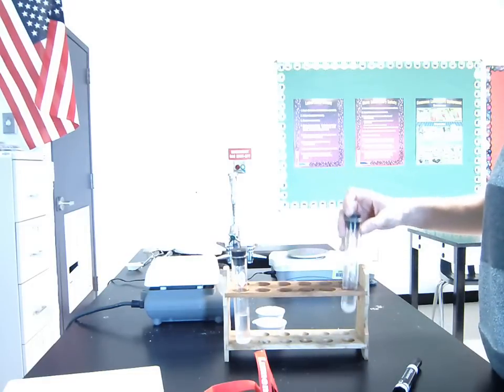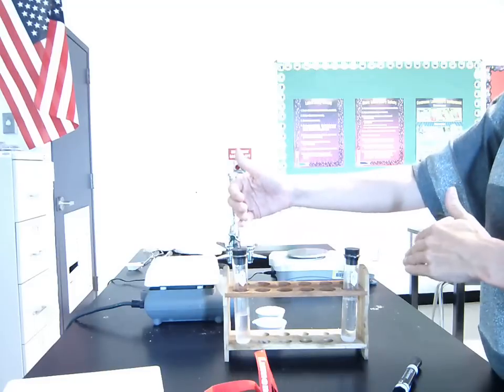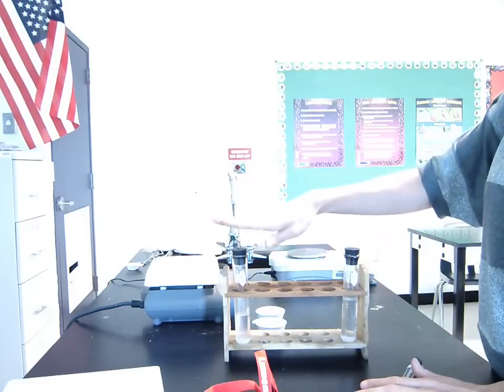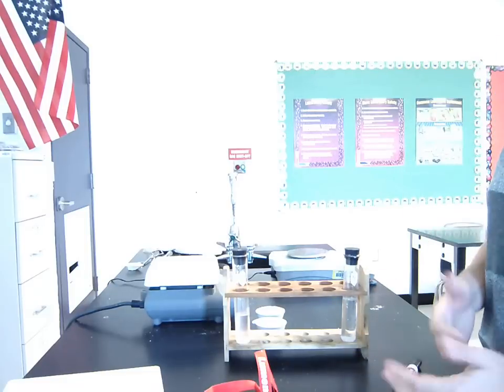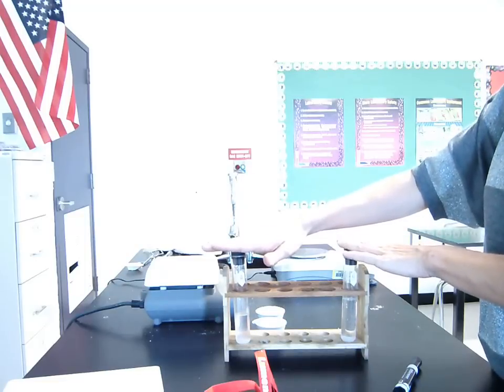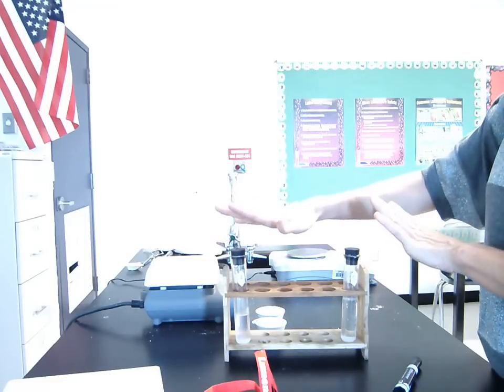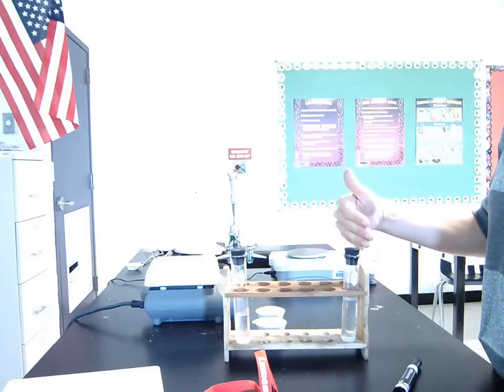So I'm starting with two saturated solutions, two different saturated solutions. For the purpose of the lab, we're just going to call them A and B, just for simplicity's sake, because it doesn't really matter what the substances are. Okay, so that's the saturated solution part. That part's done. Now what I want to know is what's the concentration of each of these saturated solutions.